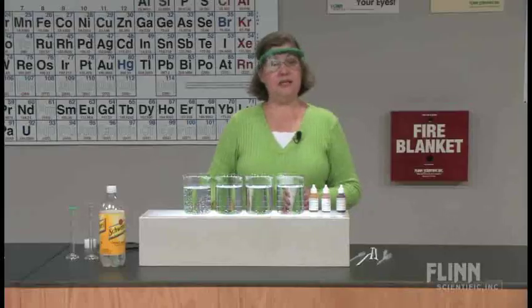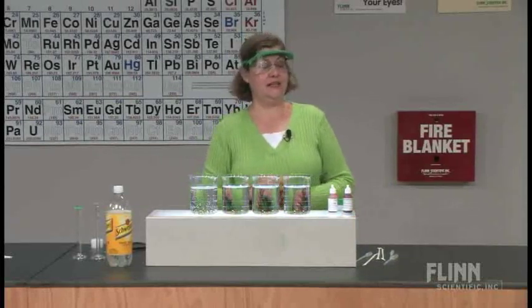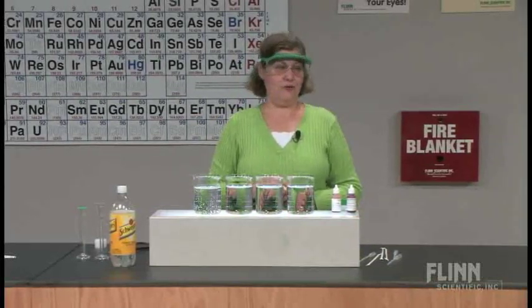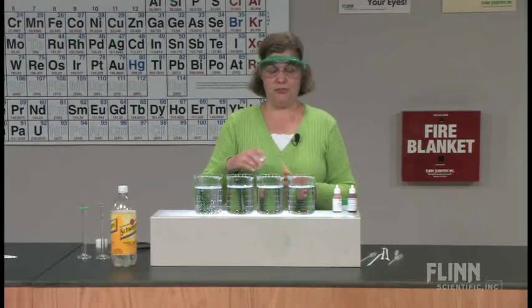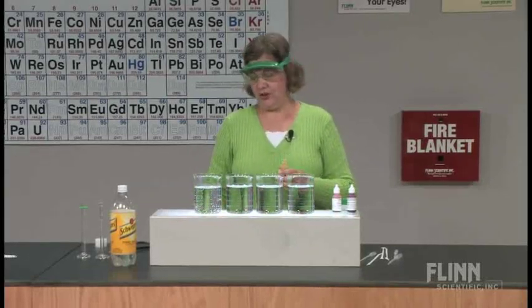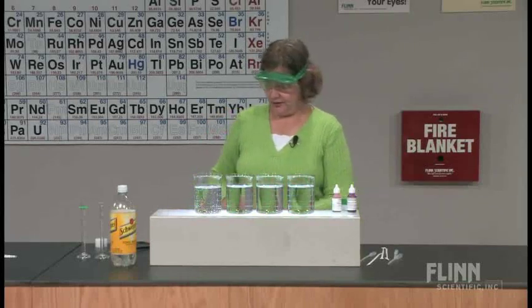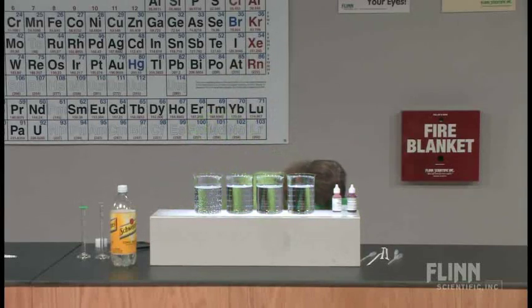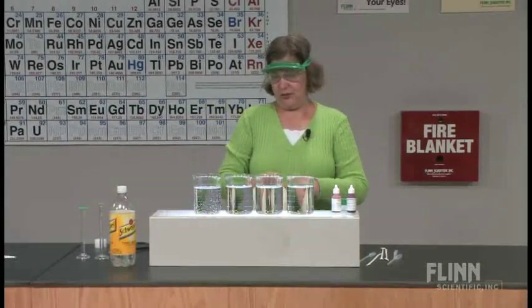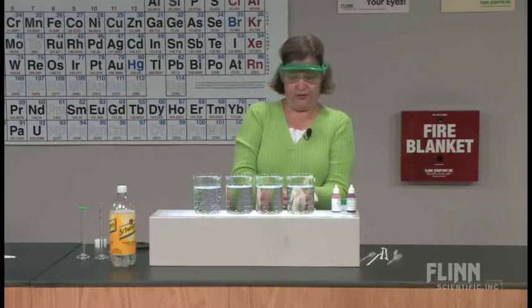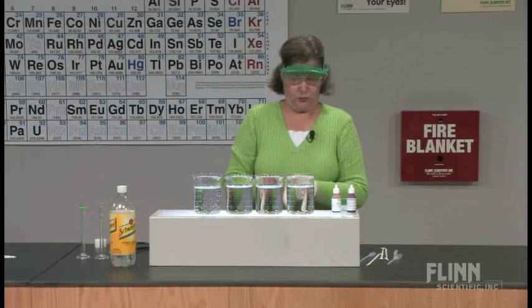Now, the three dyes that we're going to look at are fluorescein, eosin, and rhodamine. Those are not substances that roll off the tongue with the exception probably of fluorescein, which is the most well-known fluorescent dye and is used in a lot of applications. I'm going to measure out about 15 milliliters of the fluorescein, about five of the eosin, and about one of the rhodamine.